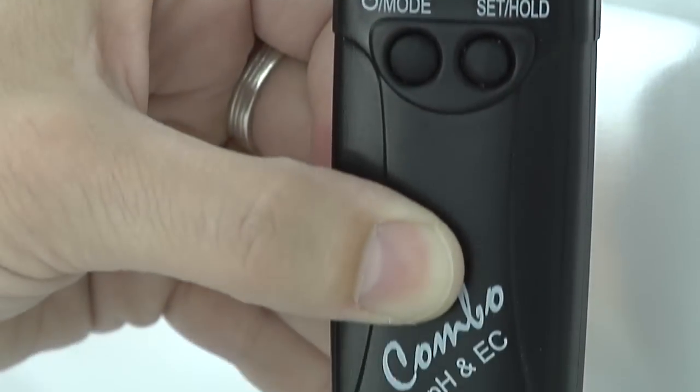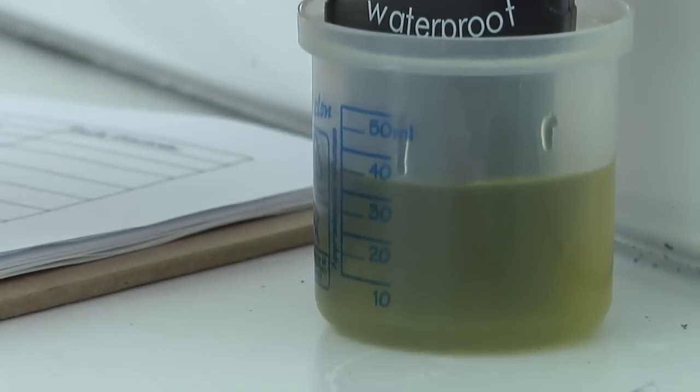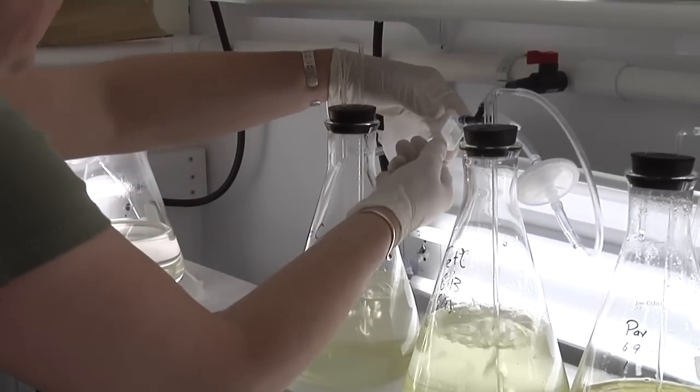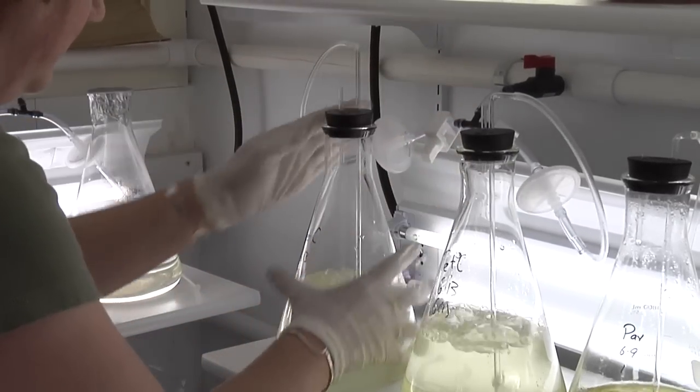If the samples are getting too acidic, we will decrease the amount of carbon dioxide that we're giving them, which turns to acid if it's not being used.